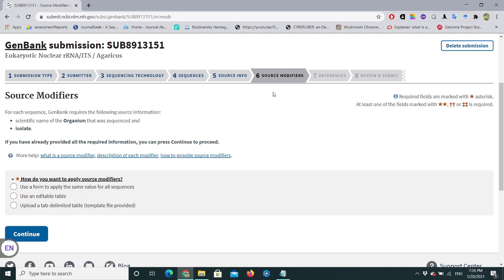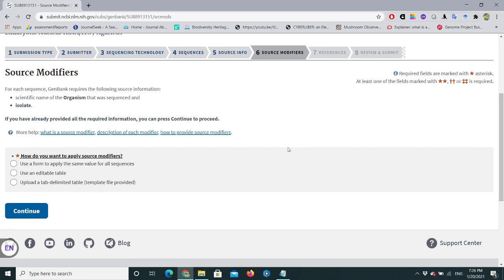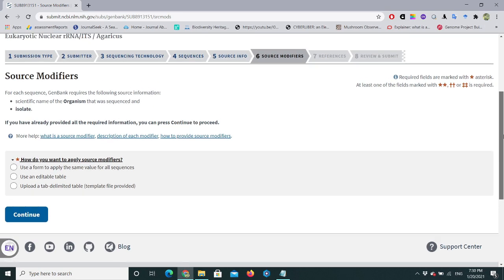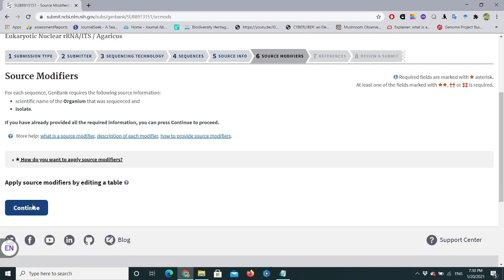Now we have step six — Source Modifiers. Here we need to label our sequences with important information such as country name, organism name, isolate, and strain. There are three options: use a form to apply the same values for all sequences, use an editable table, or upload a tab-delimited template file. I'll choose 'Use an editable table', select Update, and click Continue.